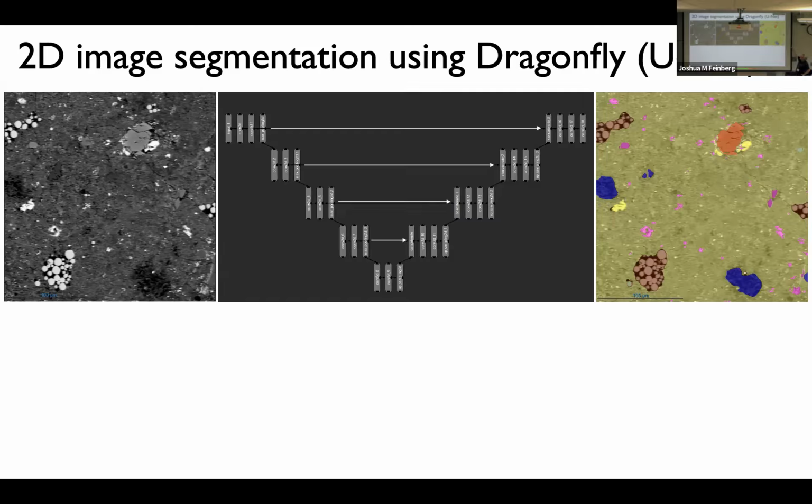And this particular one, UNet, is a very common one. If you do any sort of segmentation in machine learning, you'll come across UNet as probably the industry standard approach for doing this. What you need to do is you feed in to this neural network, at one end, each one of your images. That then is taken through a series of convolutional steps which reduce the size of that image gradually, so building up sort of bigger and bigger scale information.